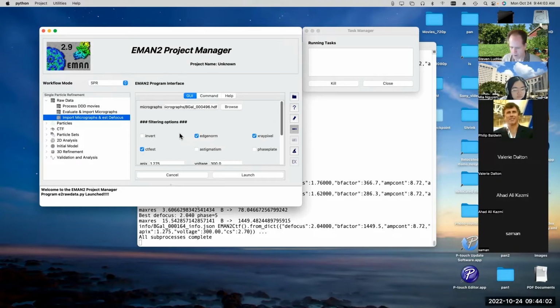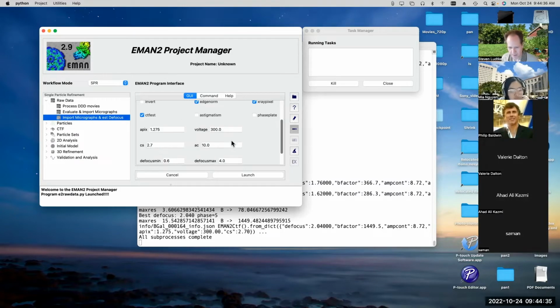Yes. So it's a convention, and it's actually the convention that's used by pretty much all the single particle packages nowadays. So when you see the raw micrographs originally, they will look darker nowadays. Now that wasn't actually always the case. When you collected data on film, there was often a conversion from what you see on the film to optical density, which anyway, old stuff from history. There are historical reasons for all of these things.